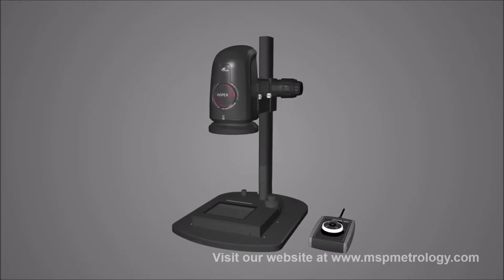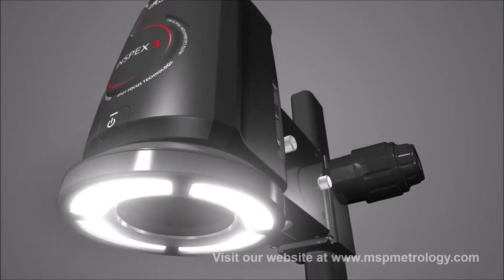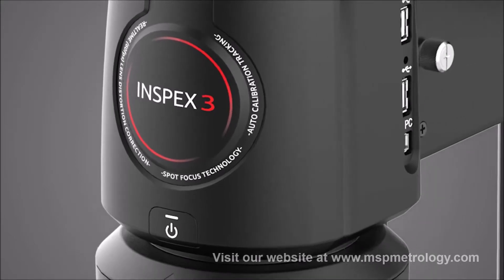Simply unbox, set up, plug in and go. Factory calibrated with our unique patented calibration technology, ready to measure out of the box.